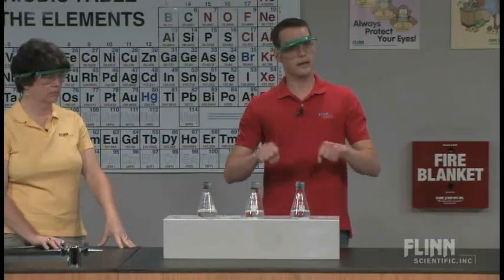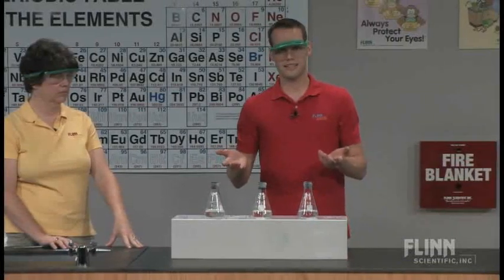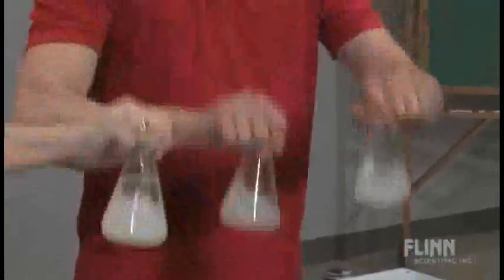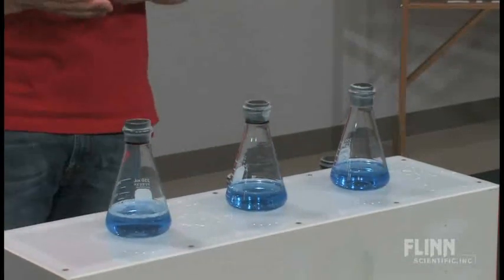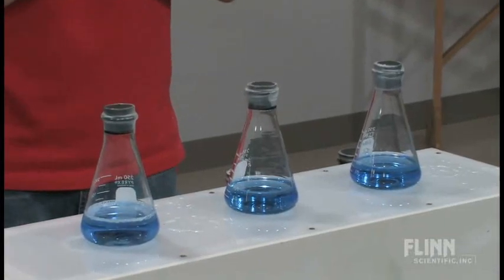We're going to do the same thing, shake 10 times, and see what happens with the different concentration of potassium hydroxide in this reaction. Ready? And 1, 2, 3, 4, 5, 6, 7, 8, 9, 10. So same thing. We get a blue color. And sometimes I'll use this at the beginning and I will tell my students which flask has which amount of potassium hydroxide in it.